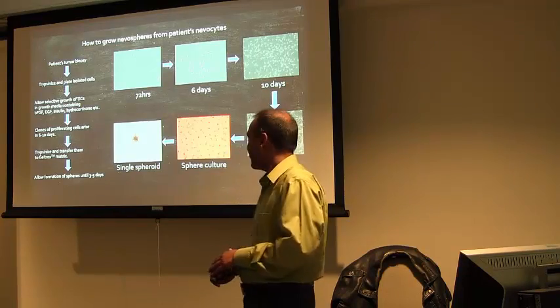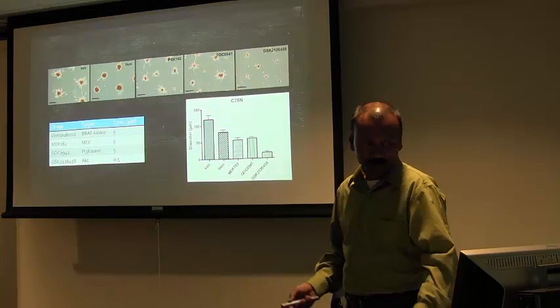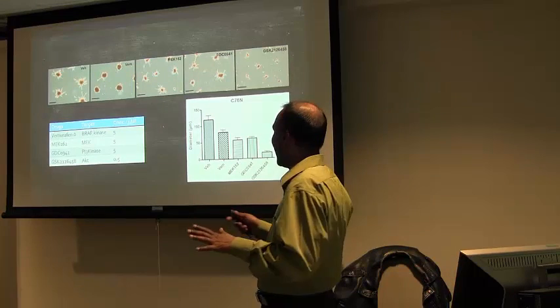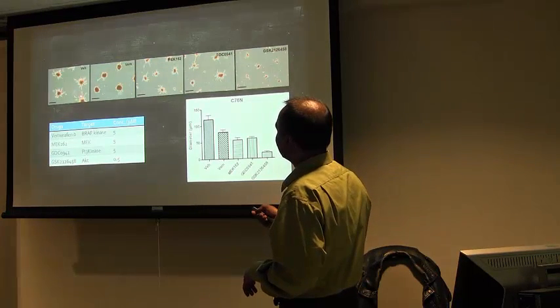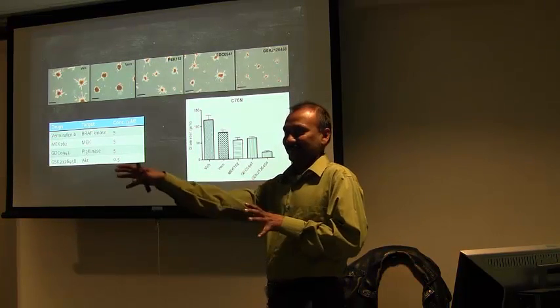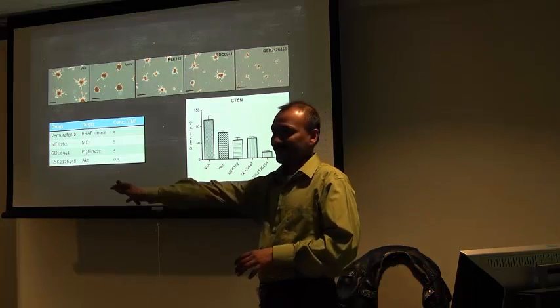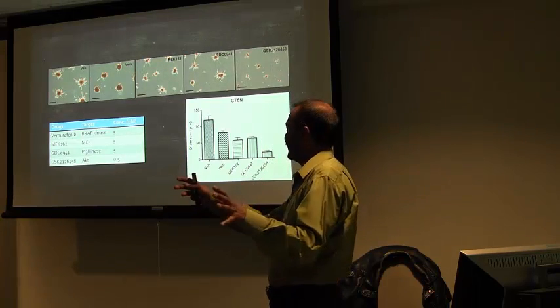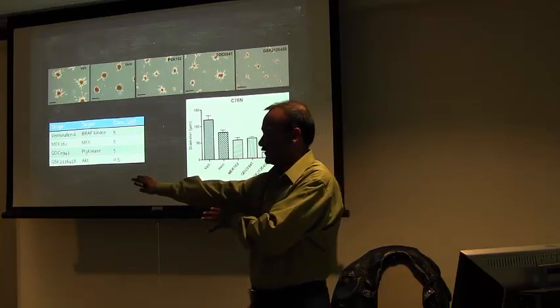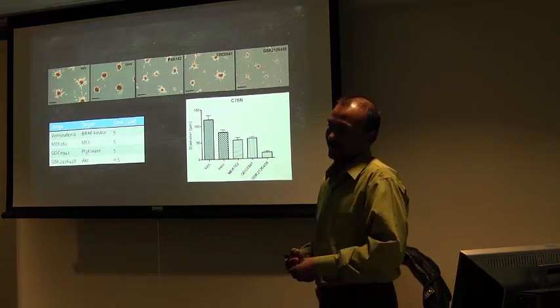So what happens is, I'm going back to the pictures. If you look at these cells, the number of spheroids will not increase, but look at how these cells are touching each other. As the spheres grow big, they seek out their partners. They're very interesting cells. They want to touch each other. As they grow, they come in the vicinity of the other neighboring colony and sort of touch each other. So I stopped there. You can still go on. It's no big deal.